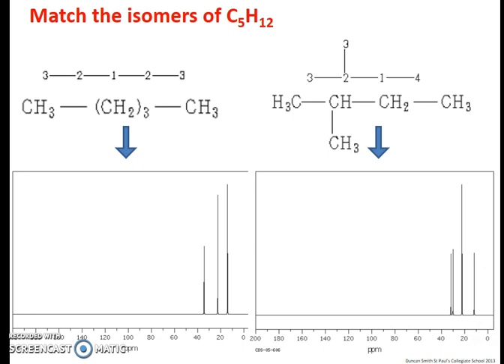Similarly, in the spectrum on the right, in this case you've got 2 different CH3 environments. The smaller peak to the far right at about 10 ppm is the one that they've identified as carbon 4. The next one, the double height peak, is the 2 CH3 groups that are identified as carbon 3. So you can see there is some correlation there, at least for alkanes, between peak height and the number of carbons being represented. But it only works for alkanes or the alkyl groups.